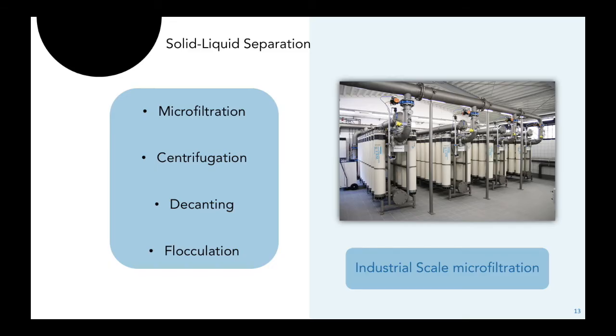Solid-liquid separation. Techniques that are commonly used to separate inoculum and aqueous compounds from cellular debris include microfiltration, centrifugation, and decanting. Flocculation precipitation, however, is the most effective large-scale separation technique. Flocculation is a technique which utilizes the chemical properties of cells within a culture to bind to an added floc to increase the size of particles, making filtration and separation of cellular substances from culture medium simpler and more accurate. This phase of processing removes cellular debris from the culture containing the aqueous desired compounds.